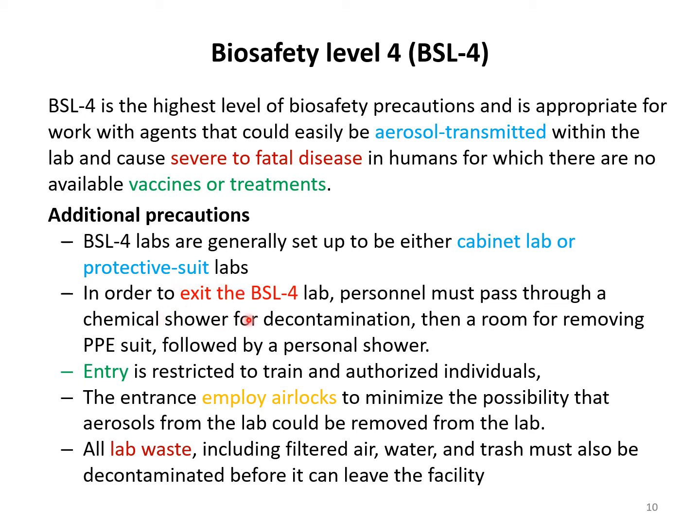In order to exit BSL-4, the people who are working have to pass through a chemical shower for decontamination. Then of course there is a separate room for removing the PPE or suit, followed by a personal shower. So you can see how advanced and sophisticated the settings we need for BSL-4 labs are.